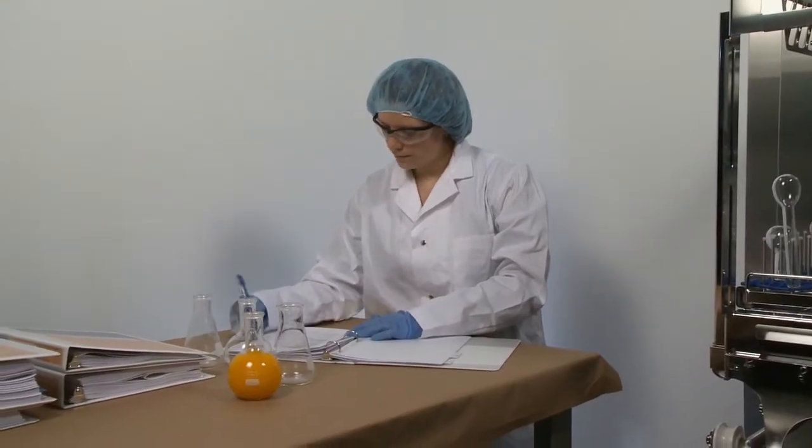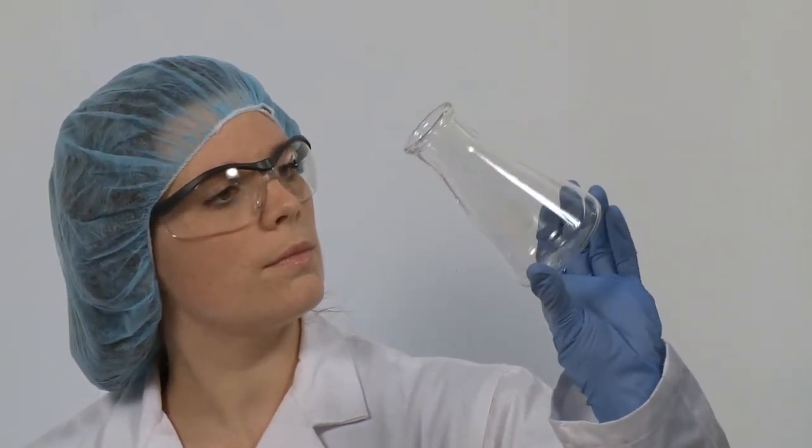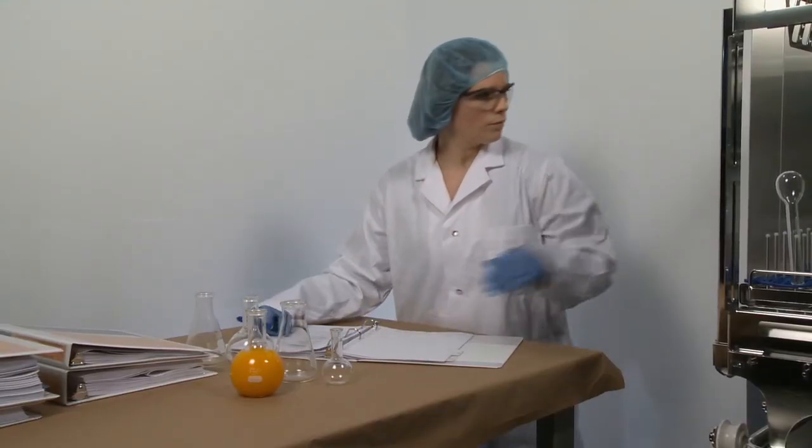All Steris Pharmaceutical Grade washers are thoroughly inspected with our customers at our factory acceptance testing area. Complete coverage and cleaning tests can be performed to ensure desired cleaning performance is achieved.